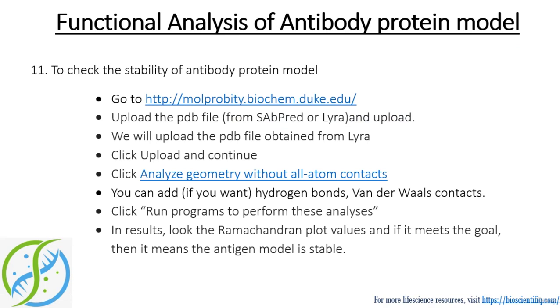For that you need to check the stability, just like how we checked the stability of the antigen protein model. An antibody's stability greatly influences its performance, its specificity and affinity. So that's why it's really important to check the stability of the antibody protein model. To check the stability, again we need to go to MolProbity and upload the PDB file.